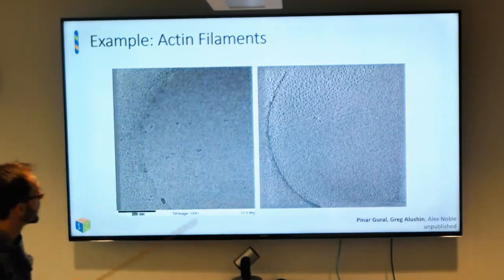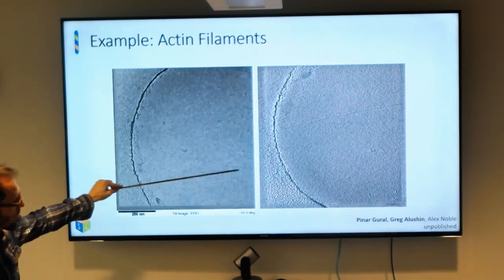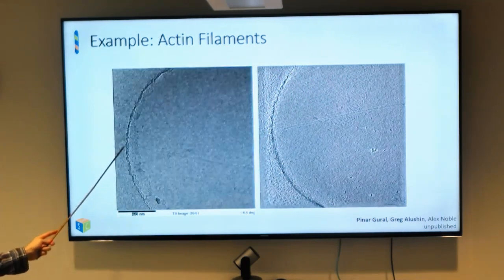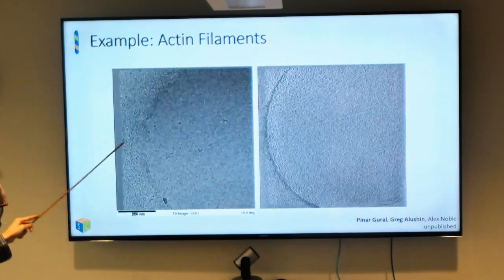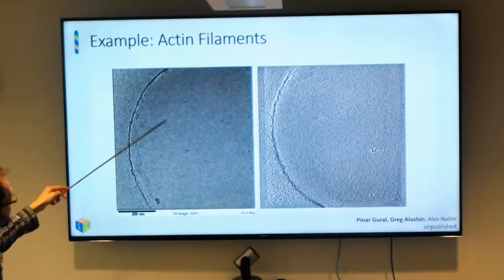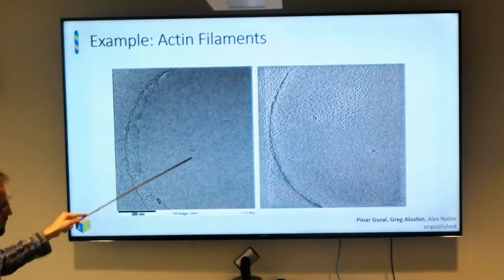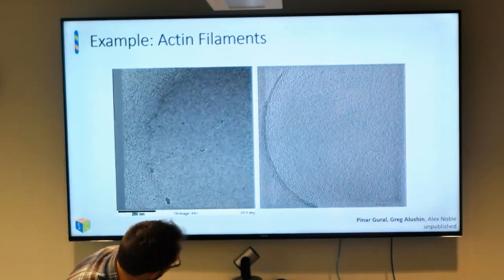Here's another example of a group who has interest in how actin deals with stress and strain, so pushing and pulling on it. And so they have protocols where they can stretch a single actin across a cryo-EM hole. So everything else here is just ice. There's some weird leopard skin ice in this particular scenario. With Tomo, you can align this tilt series. I don't think anything else can. So we have 3D information of a single actin across essentially buffer, a hole with buffer in it.